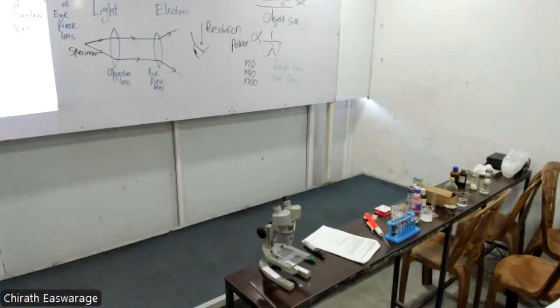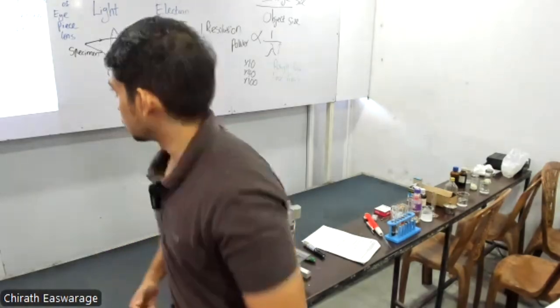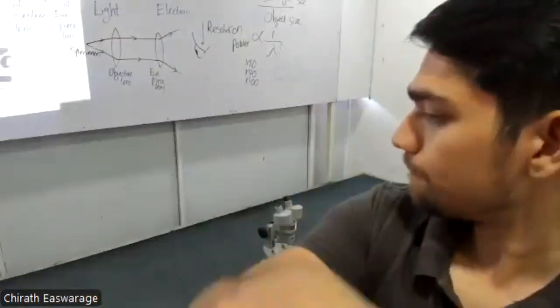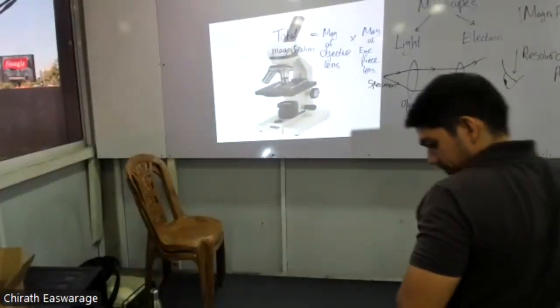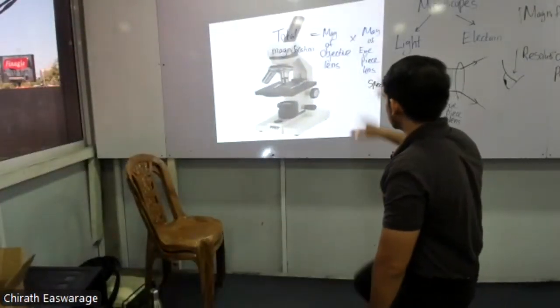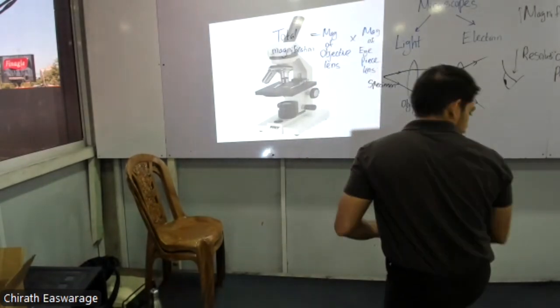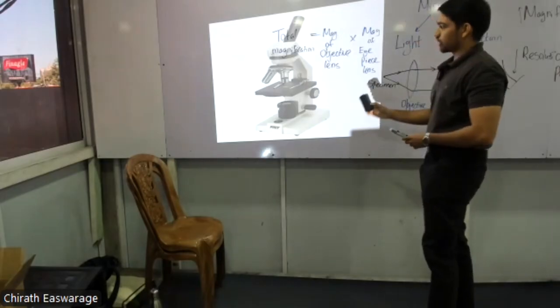This is a rich microscope, right? Not like mine. It's a complete one. Online students, hold on. So using this, let's do some proper labeling, and then you can draw one of your own.